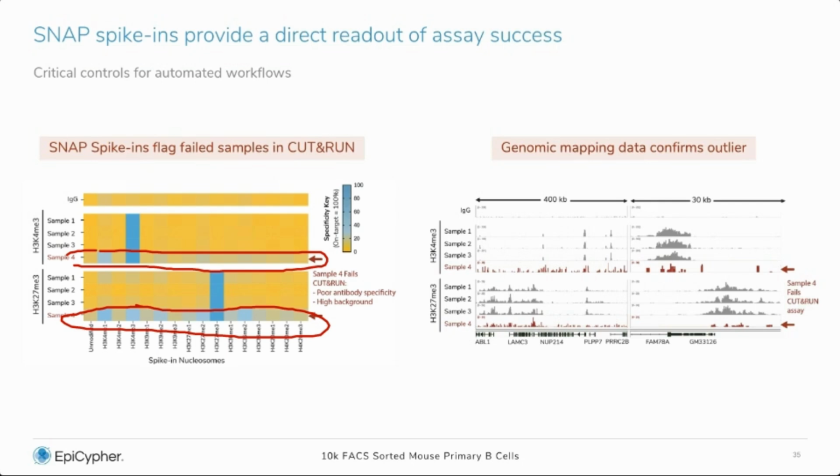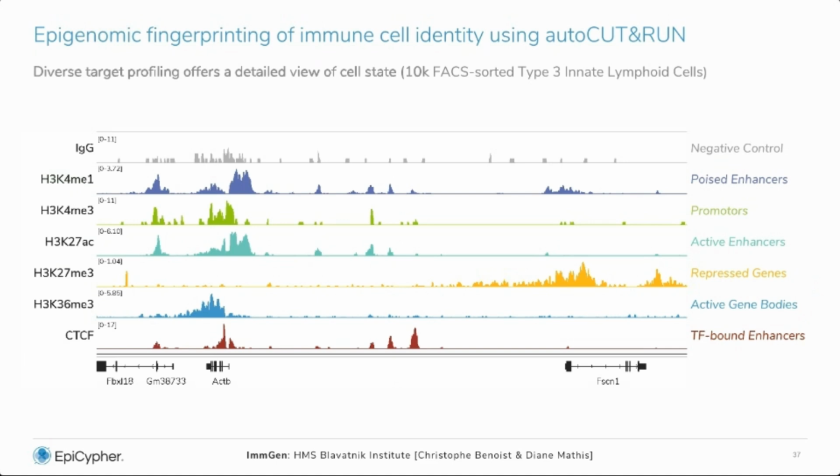And the same thing happened in the genomic data. So this just didn't have great recovery in the genomic data. If we only had this information here on the right, we might not be so confident to throw this out. We don't really know what happened here. Is that really a reflection of the sample or the genetic perturbation or the treatment? We don't know unless we have those defined controls that really show that there was a problem with that overall sample preparation.